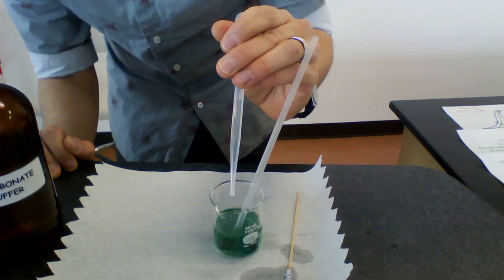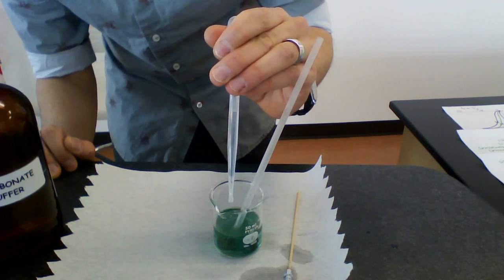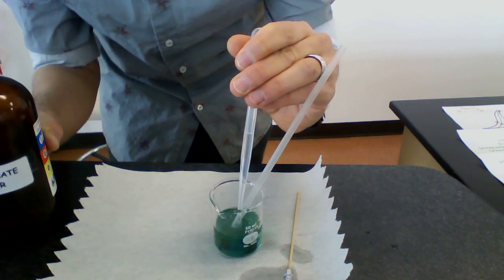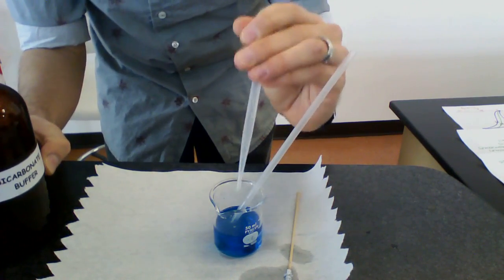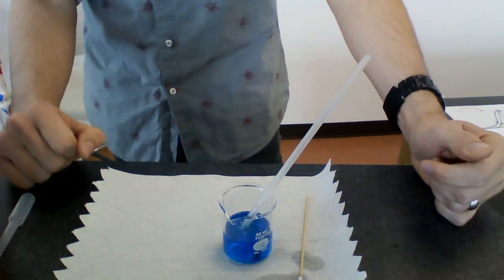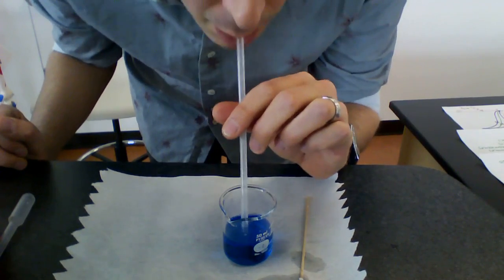There is no way possible that I could exhaust the buffer capacity of what I'm going to put in here. So when I put it in, it's going to buffer it, and it's going to bring it to pH 7.4, sorry, 7.4 bicarbonate buffer. And so 7.4, nice and blue, and now it's buffered. I could try the experiment again.